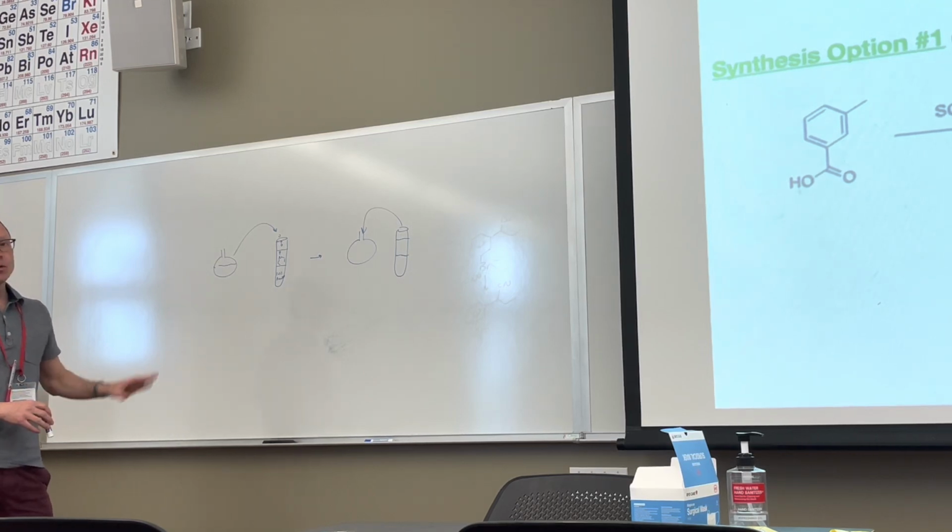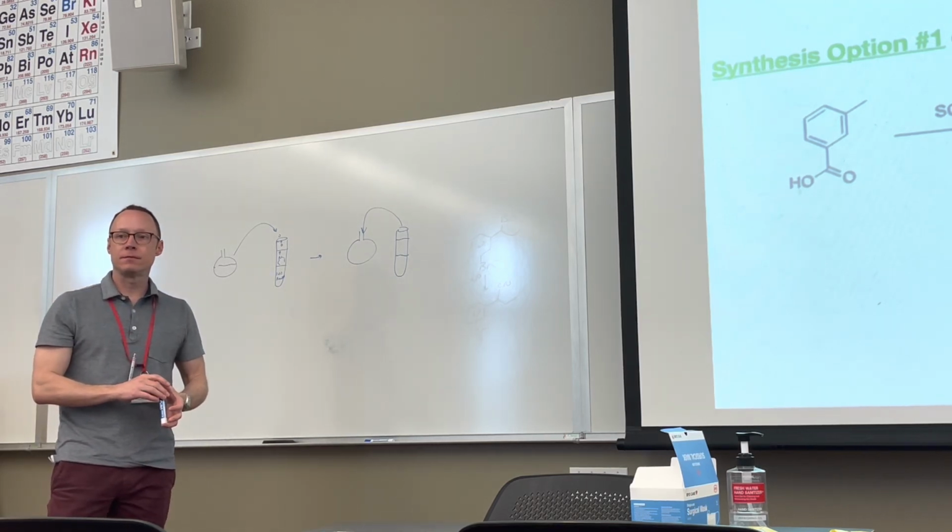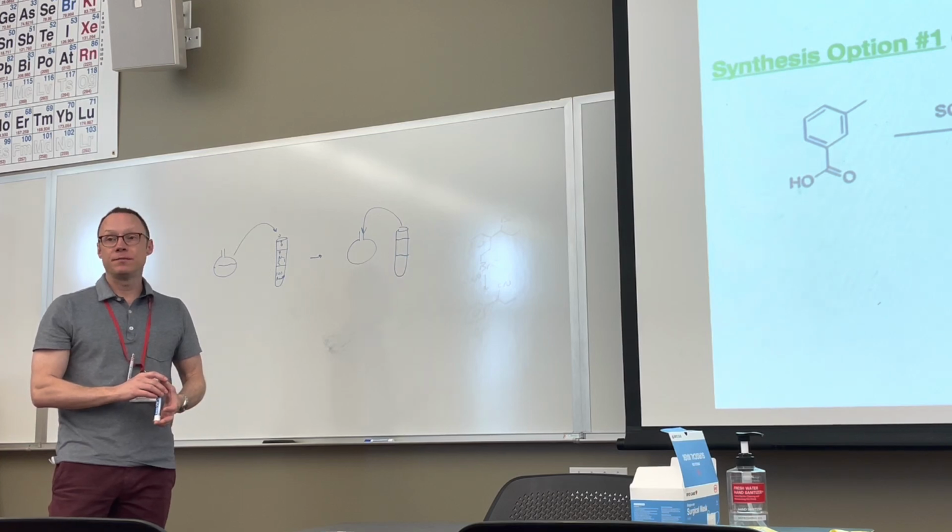Okay. Any questions on this for those of you who have part A? Should we keep the test tube in an ice bath while we add the mixture? Yeah, I would.